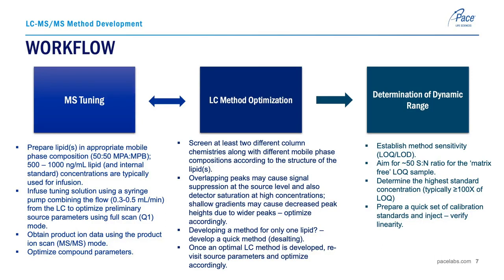A tuning solution is prepared with one or more lipids and corresponding internal standards, typically at 500 nanograms per mL or 1 microgram per mL concentrations. The solution is then infused, combining with the LC flow. Collect the precursor and product ion transitions and optimize the source and compound parameters.